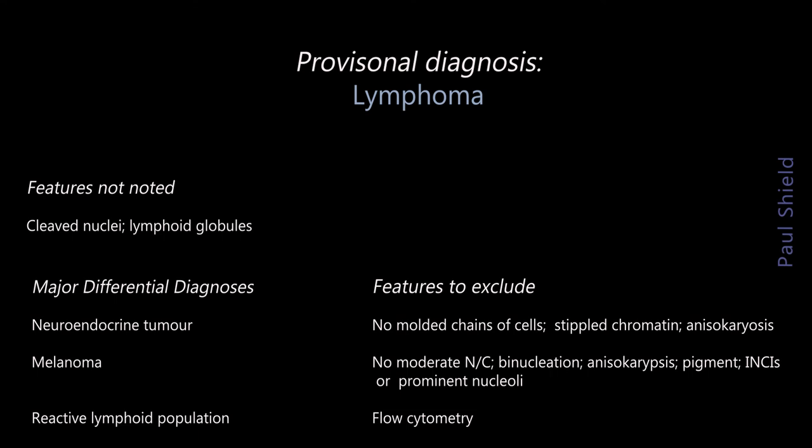Probably the most difficult thing, obviously, then is a lymphoid reactive population, and that would really require flow cytometry in order to rule that out.